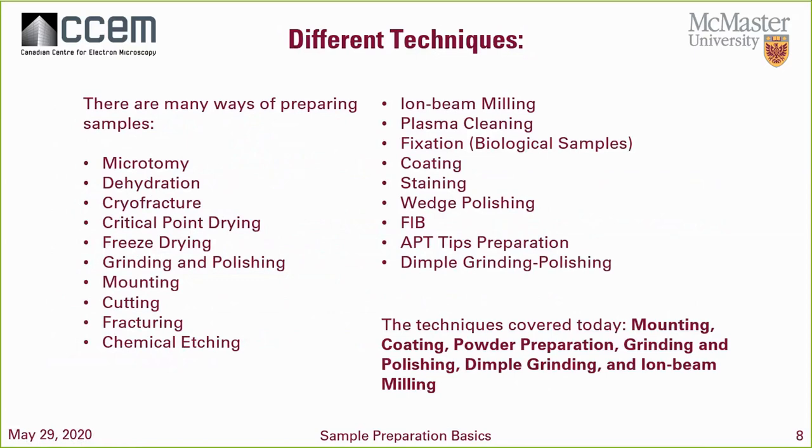You might wonder, well, Jhoynner, all of this before, what sort of techniques are out there? Well, this is just a few here on your screen, okay? We have microtomy, right, which involves the thin slicing of materials that are polymer based, insulating based. So it uses a diamond. Dehydration, obviously the biological people might know that a little bit better.